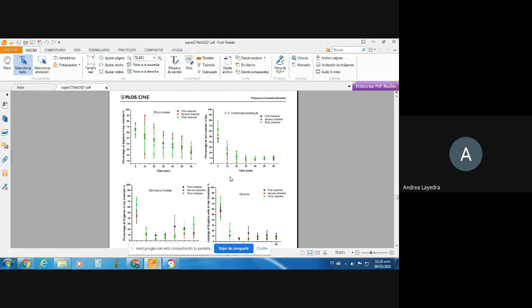In conclusion, the efficacy of a microfluidic device for the quantitative evaluation of the response of protozoa to Listeria has been designed and demonstrated. In future studies, these devices can be used to compare the attraction of protozoa to two different species of bacteria. Thank you.